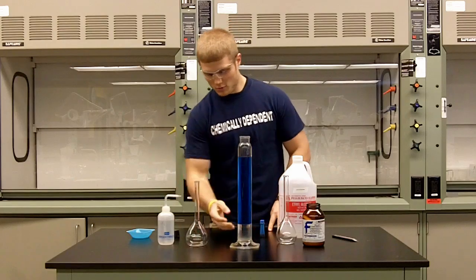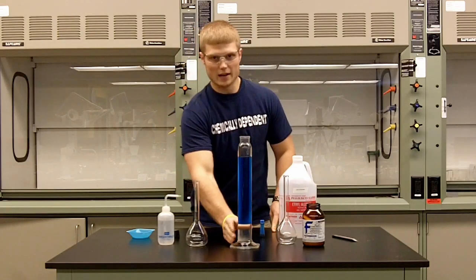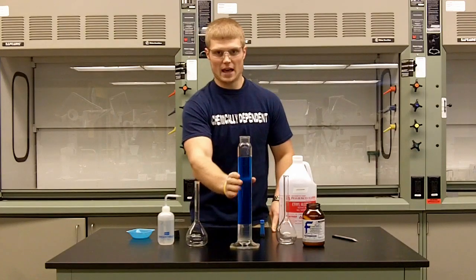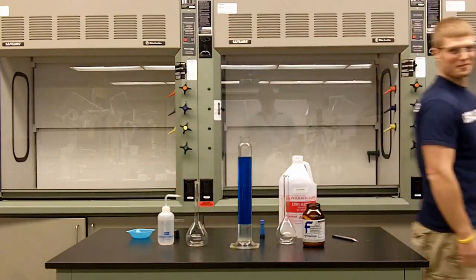So as you can see, we have a separation here. We have our water layer on the bottom, which is clear and does contain our potassium carbonate. And then we have our dye up here with the ethanol, so it's staying in the ethanol layer.